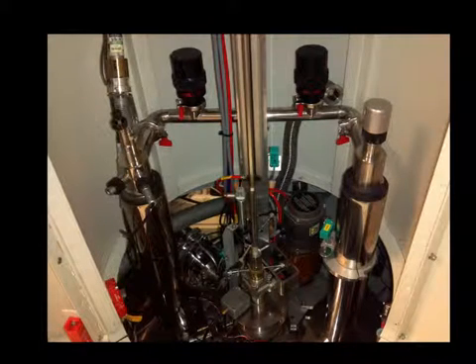So then once you've loaded the sample, you can go ahead and move this dissolution wand or dissolution stick over into the operational position. And so now this solvent system is hooked up with the DNP system. So now it's basically ready to dissolve, at least once you've built up your polarization.